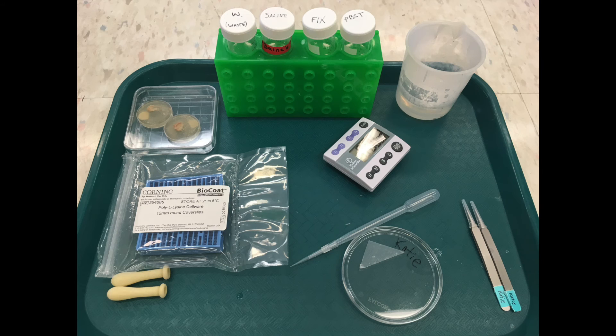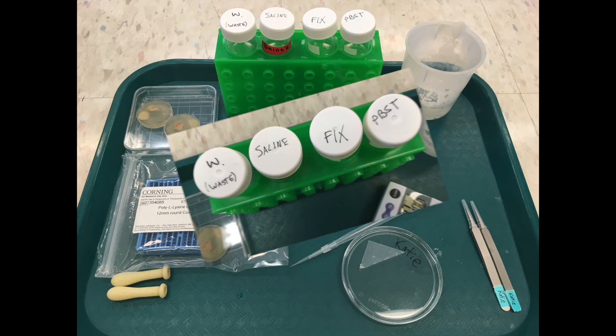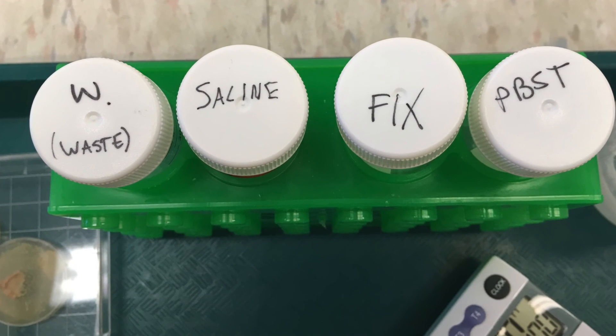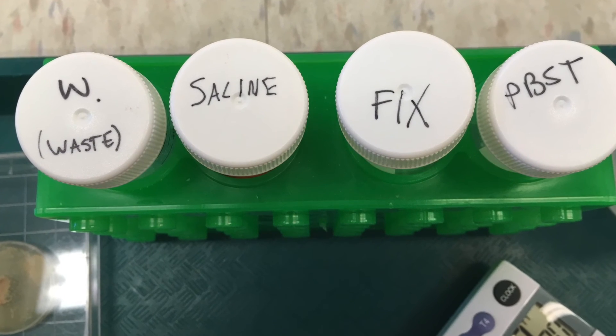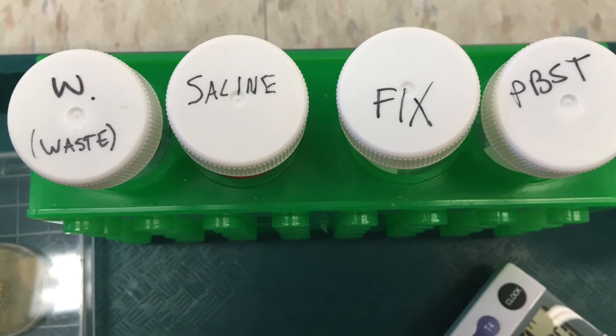Here are some of the tools you'll need: a collection cap with larvae, two sets of forceps, pipettes, cover slips, a timer, a dissecting dish, and the following solutions. Saline, which you'll need for the dissection itself, and fixative, PBST, and a fixative waste tube to prepare your brains for staining.